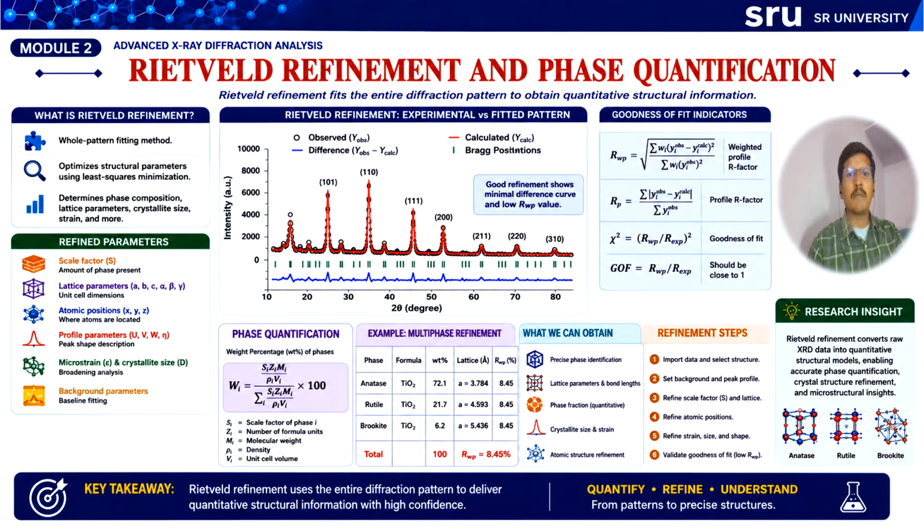One of the major applications of Rietveld refinement is phase quantification. The phase quantification is very important to understand the complete structural profile of the material.